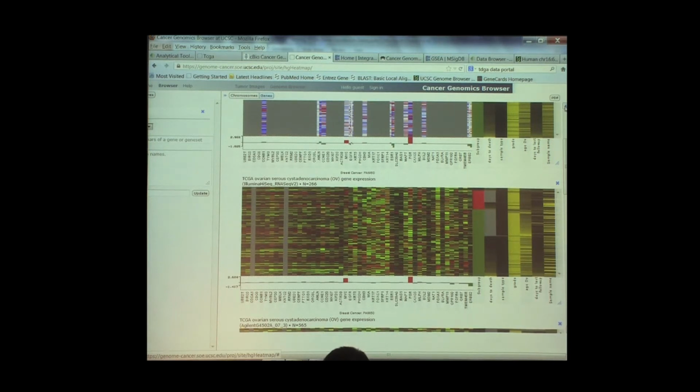So if you look, for example, at CXXC5, and you scroll down with the data sets, are you getting the same result? Why? I actually just got my thing to display. I mean, we can take an easy one. Why might you not see it in, is it even measured? It's not even measured in the protein, so that explains why you don't see it in the protein.